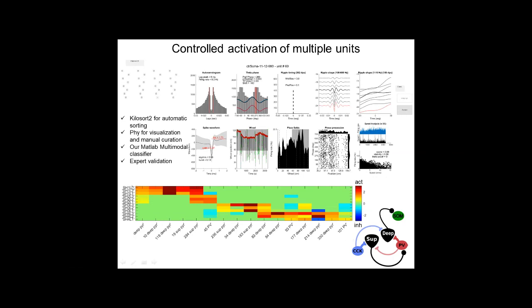And here we see how the different cells that were recorded together in the same experiments were responding to the micro LED specifically, whether we shed the light in shank 1, 2, 3, or 4, across micro LED 3, 2, or 1. For instance, you see this specificity, that the cell is responding more vigorously. Here activation is red, inhibition is blue, when you shed light from the deeper LED as compared with the more superficial LED in the shank where the cell is seated.